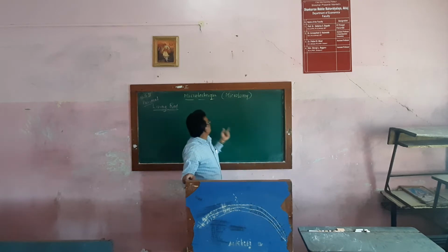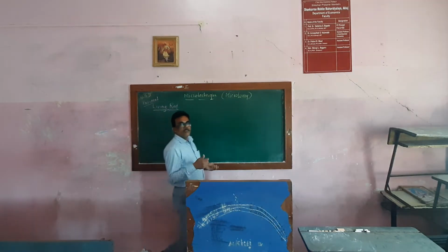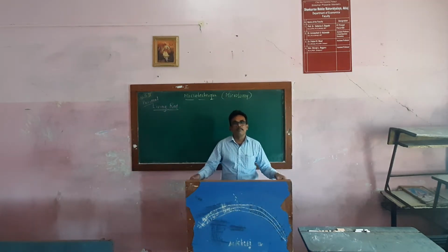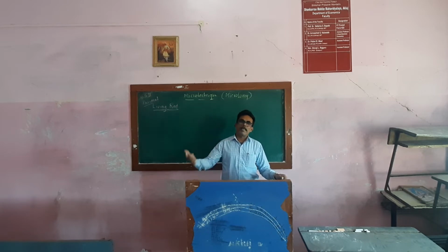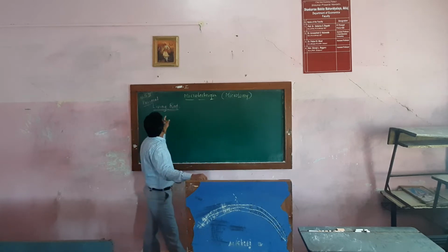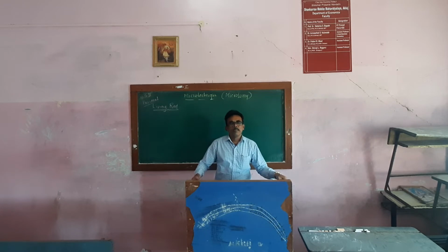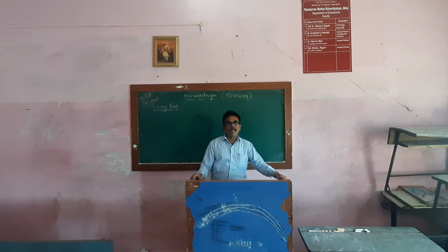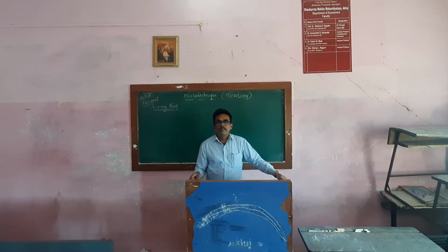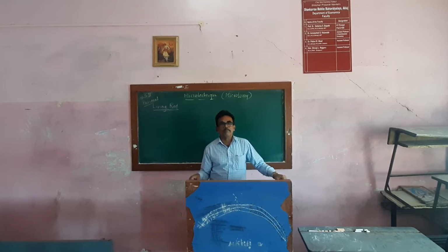If you put the bhaji inside the rat cages and place them in godowns or where grain is stored, the rats are plentiful there. We can collect the rat early in the morning from the cage, then transfer it into a wire bag, and immediately we can hold it.